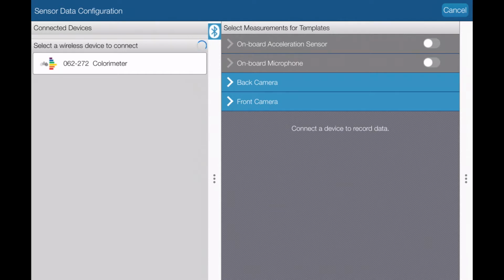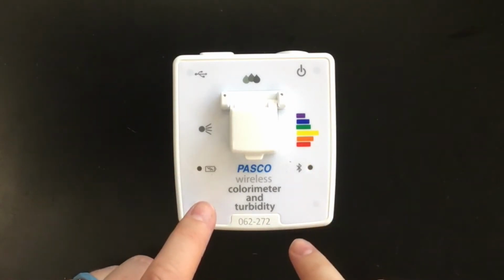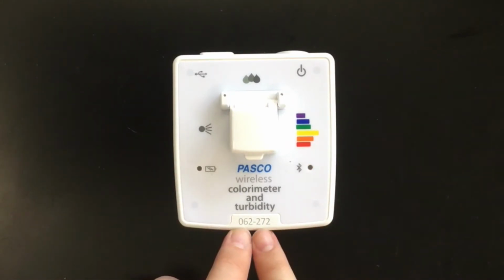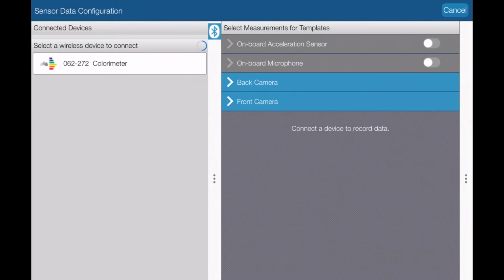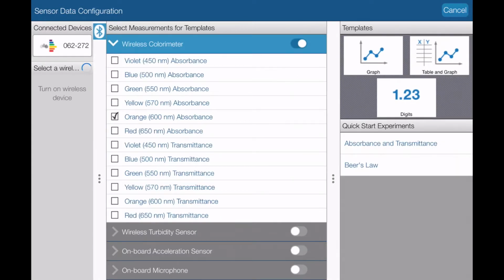Make sure that the numbers on the colorimeter that you choose match the numbers on the colorimeter that's in front of you. To connect your wireless Pasco probe here, you'll need to match the number on the screen of SparkView to the number that's on your colorimeter here. So click to connect. And then you'll need to choose the correct measurement. Because our solutions are blue, we are going to use red absorbance. So unclick orange and click on red. Then you'll need to click on digits.